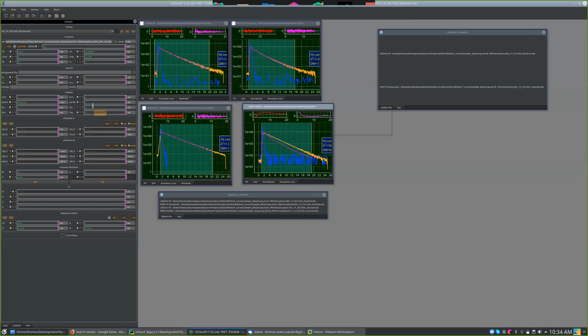Okay. Let me summarize regarding these PDDM parameters. So A to B and B to A are normalized, right? They just give the direction. If you have 1, 0, you have FRET from A to B. If you have 0, 1, you have FRET from B to A. If you have 1, 1, you have FRET between A and B. Okay, but 0, 1 is actually ridiculous? Oh yeah, then you have to switch, the names are just different. Like A is the acceptor, B is the donor.